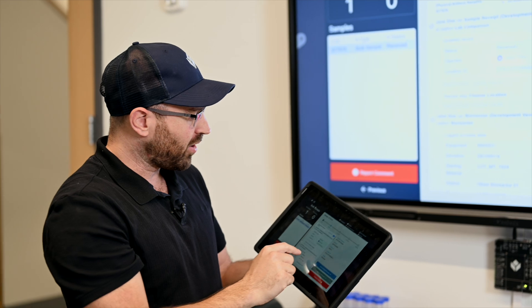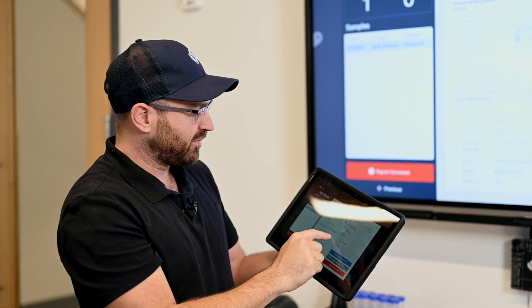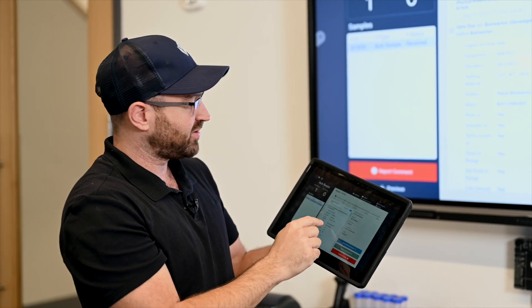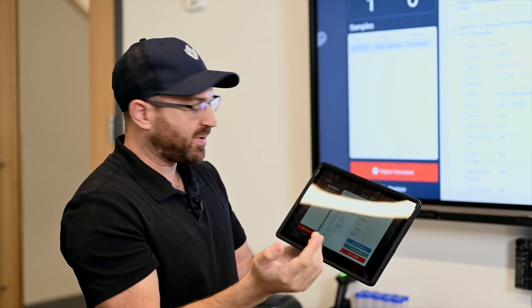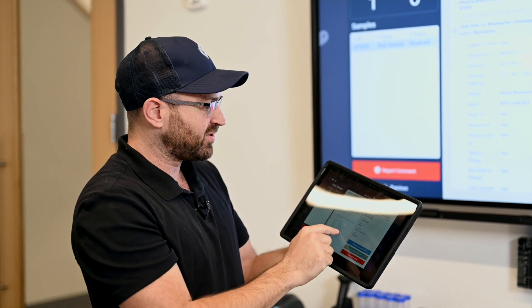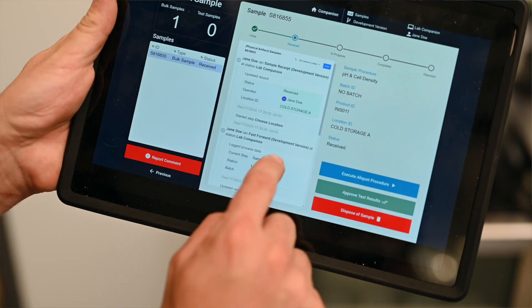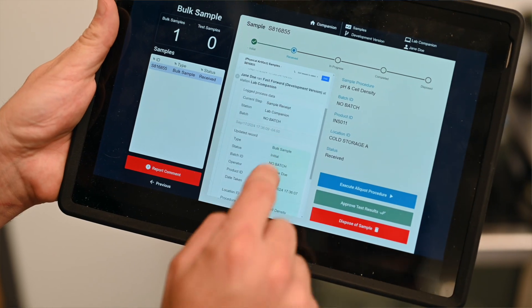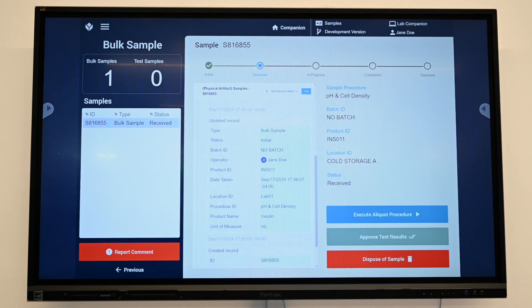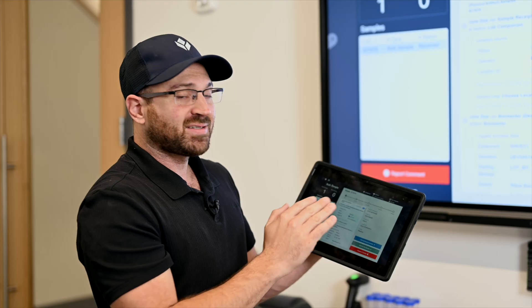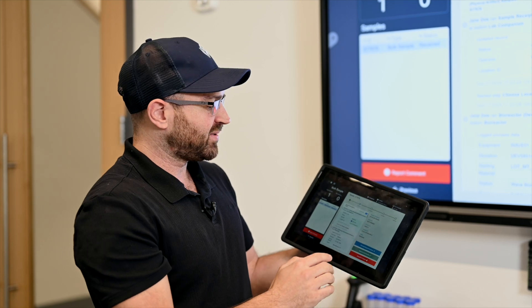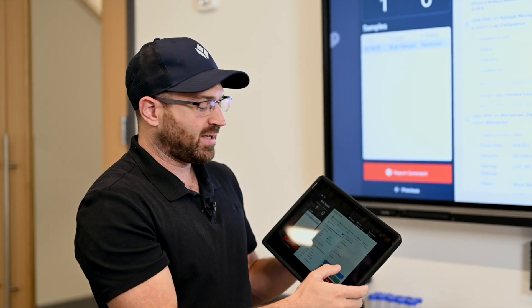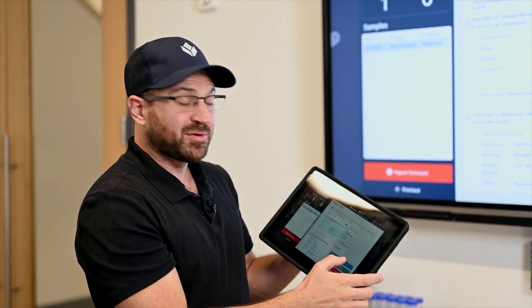All the while we're able to review exactly who took this out of which bioreactor and when. So full chain of custody is here. We can see that Jane Doe received this into cold storage just now. The next type of sample is a test sample, so to create test samples I have to jump into a different validated application called an aliquot procedure.